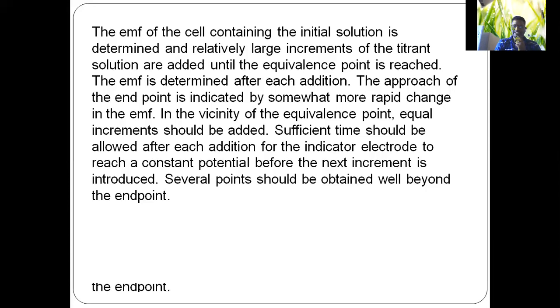In the vicinity of the equivalence point, vicinity meaning a critical endpoint, equal increments should be added. Sufficient time should be allowed after each addition for the indicator electrode to reach a constant potential before the next increment is introduced.